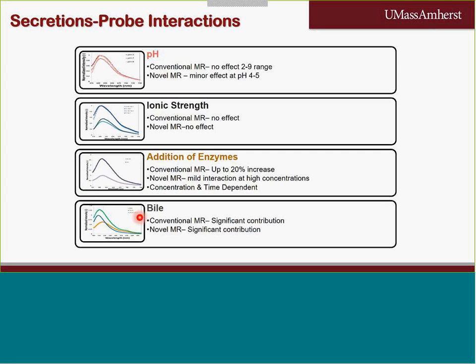And all of them, including the rotor based on an edible probe, performed in a similar way as conventional molecular rotors especially designed to monitor viscosity in model systems.